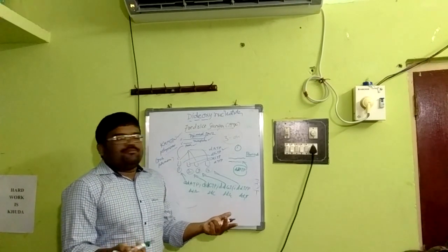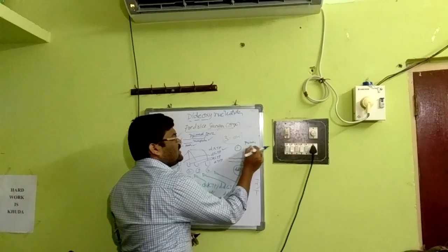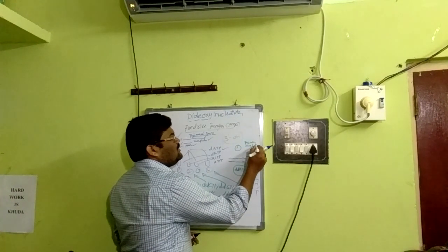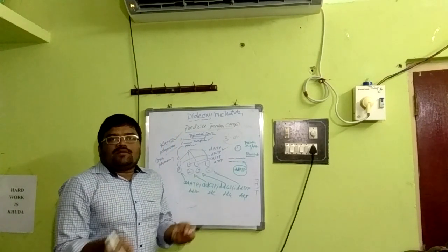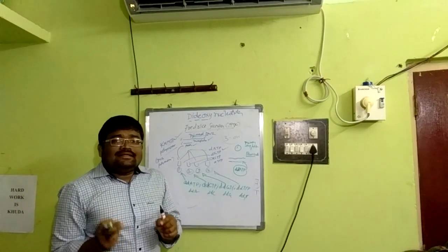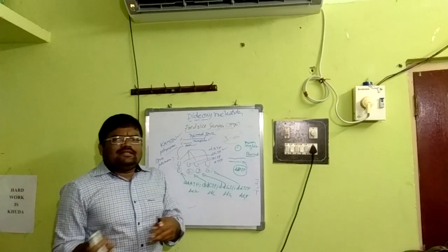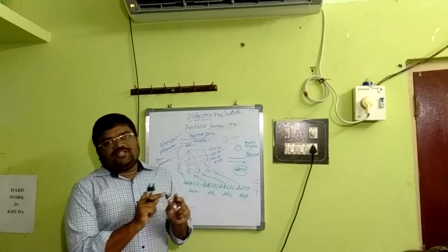Anytime it may come. For example, say primer plus 4, that means after 3 bases, or primer plus 7, that means after 6 bases. Anytime it may incorporate a dideoxynucleotide, either ddC, ddG, ddT or ddA, that means once it comes into existence, the chain will get terminated.